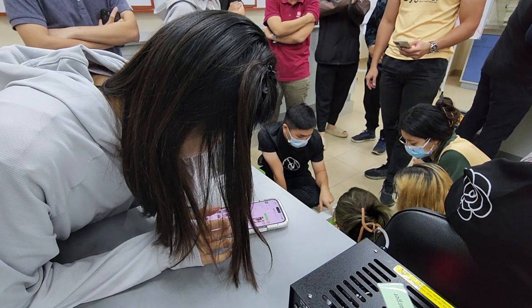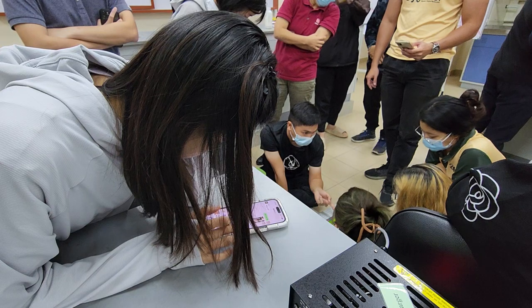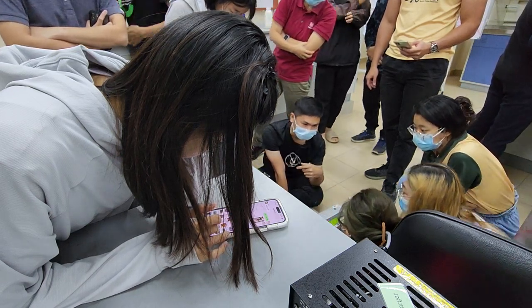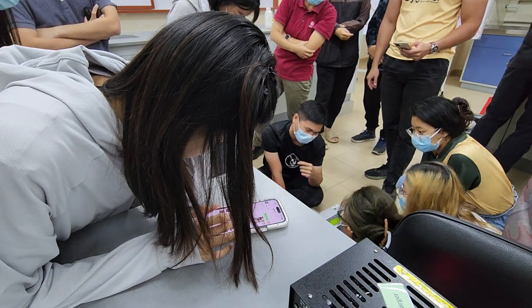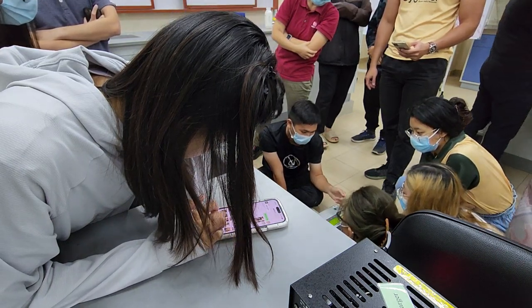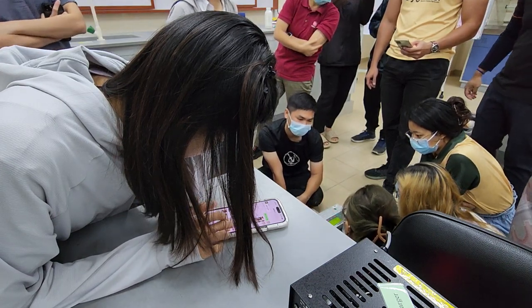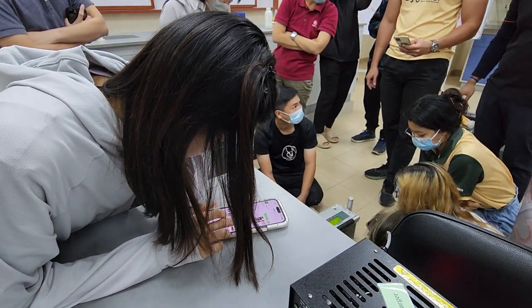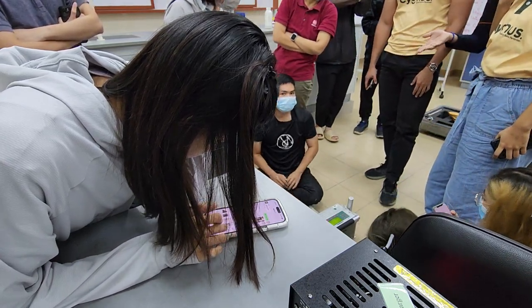Go to log and then press F1. So you already take the data. So far there is no limit on the number of logs, it just depends on the memory of this machine. Alright, so get experience, pick your plant that you want.